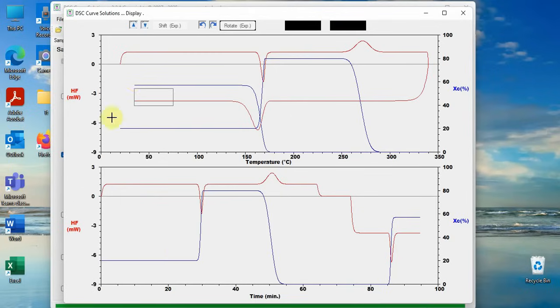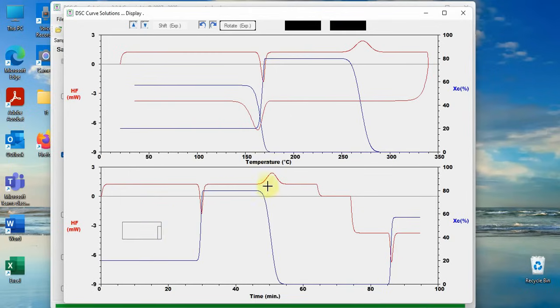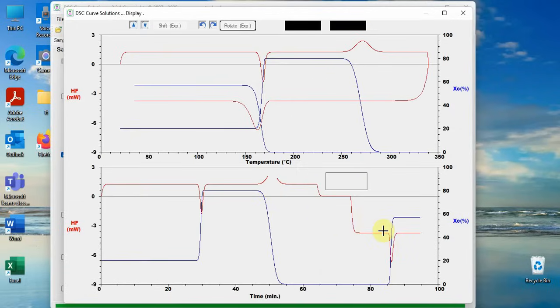The curve of heat flow versus time is shown below. You see crystallization and melting here, isothermal process here, then recrystallization during cooling. The blue curve shows how crystallinity changing with time.